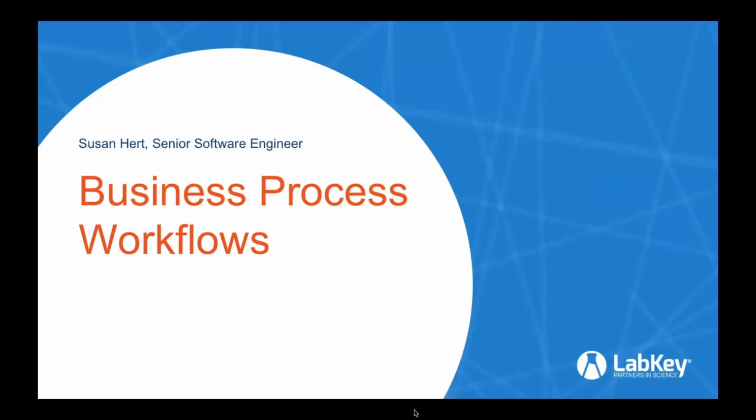So yes, I'm going to introduce you to this relatively new module for incorporating workflows into your LabKey server. Of course, LabKey has supported workflows of various types for a long time. And so I'm going to touch on the modules that you might already be familiar with, and then contrast that with the new module and its capabilities.